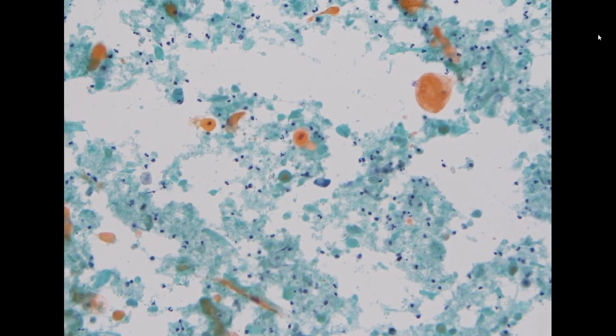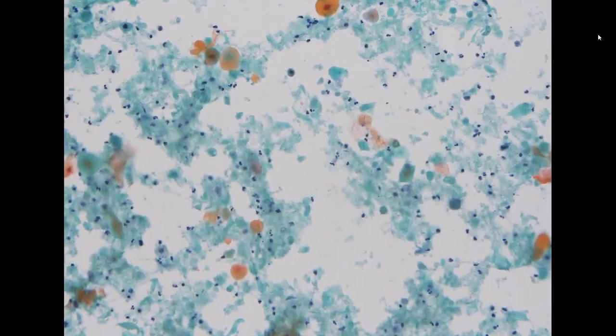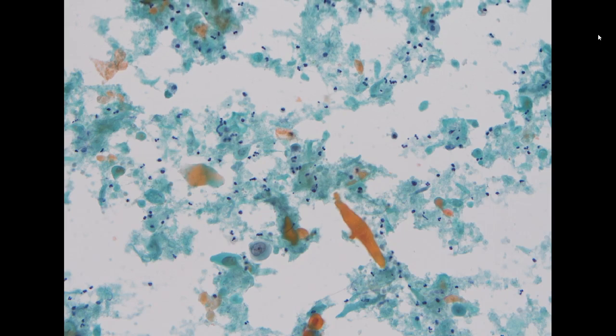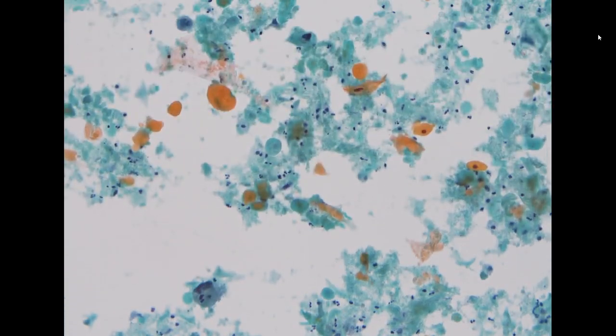So usually for metastatic squamous cell carcinoma in the body fluid, they will show very tight clusters of cells, and you will see flattened cells wrapping around the periphery of the cell cluster. That's a typical case, and for those cases, usually there's no very prominent keratinization.